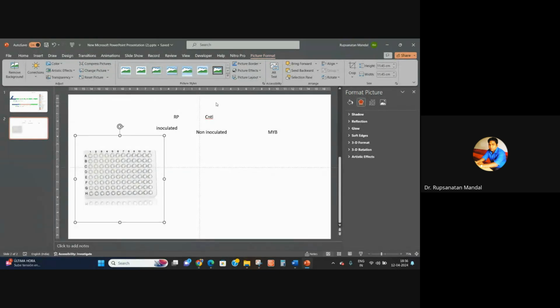That will be amplified in the qPCR and expressed by fluorescence, like SYBR Green, and that is encoded in an Excel or CSV file as a CT value. So from the qPCR we get CT values of the experimental data.